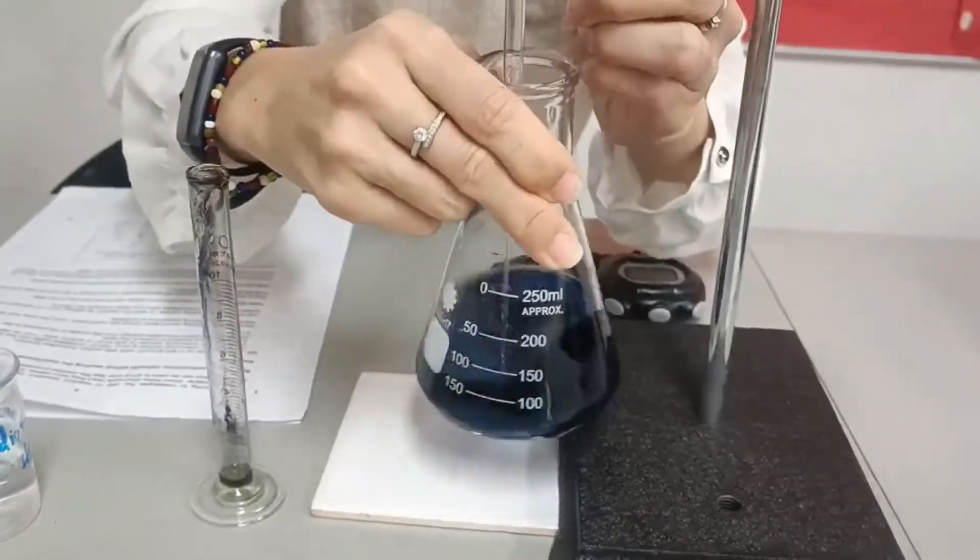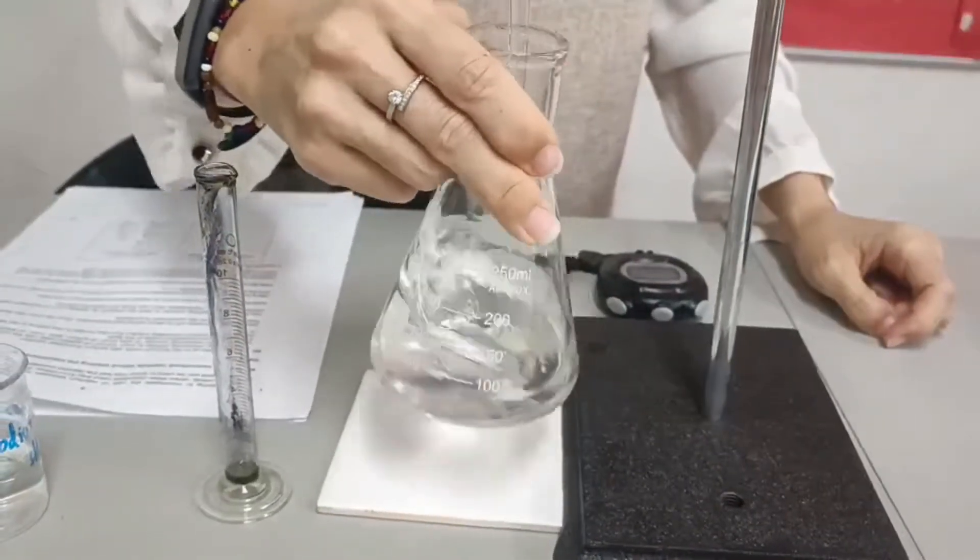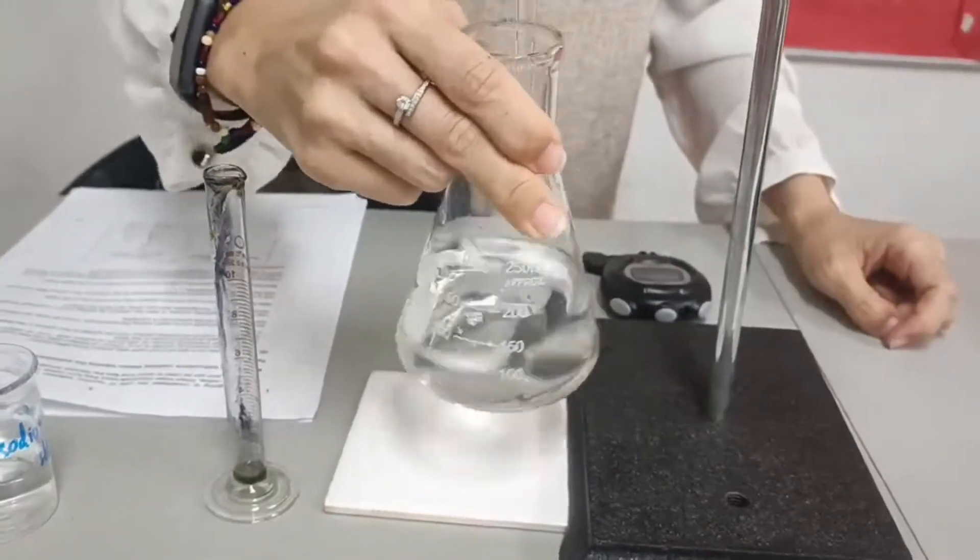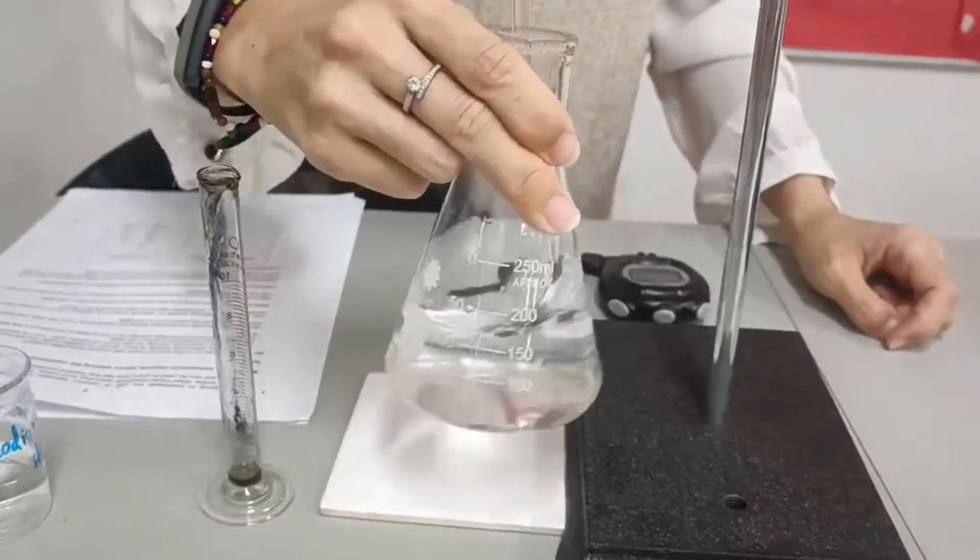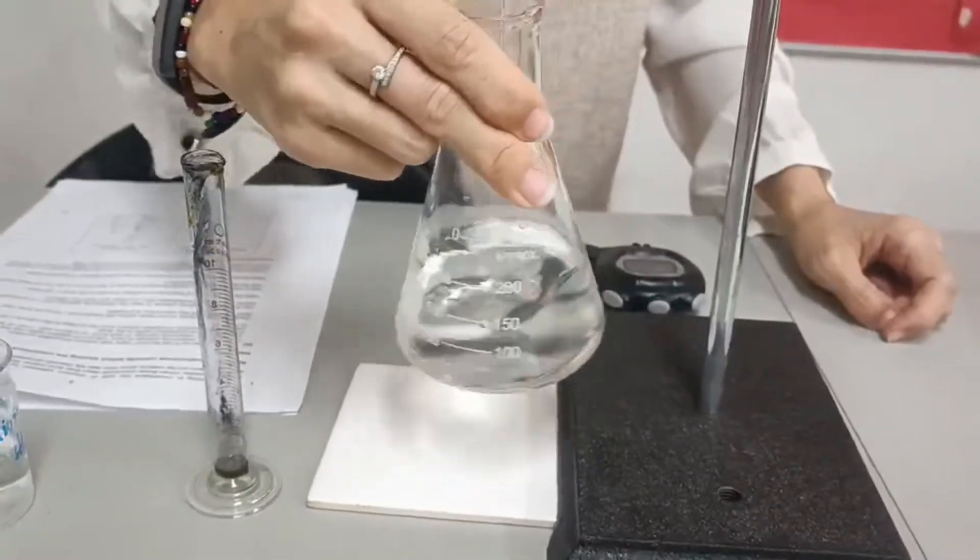Another 0.5 ml. You should be writing all the time when it turns to blue. Write them down in your table.